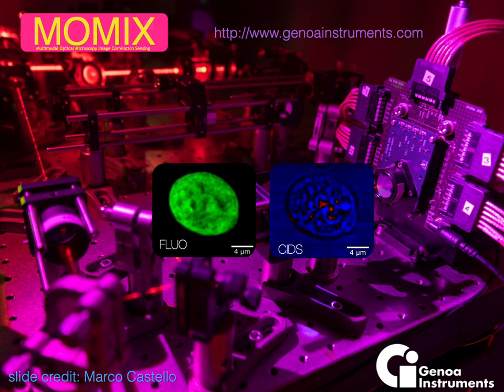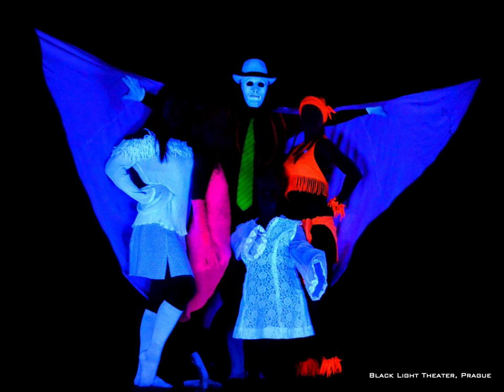So MOMIX is going to add to all we are able to do in terms of fluorescence something that we are able to do in terms of label-free, in order to try to have as output something that we couldn't see before, using the different modalities the light interacts with matter, biological matter, when matter changes. This is the big difference between nanoscale resolution in optical microscopy and electron microscopy. In the second case, you cannot follow events in time, as we are able to do. And today, we are able to do in a range that is from hundreds of micron down to few nanometer.